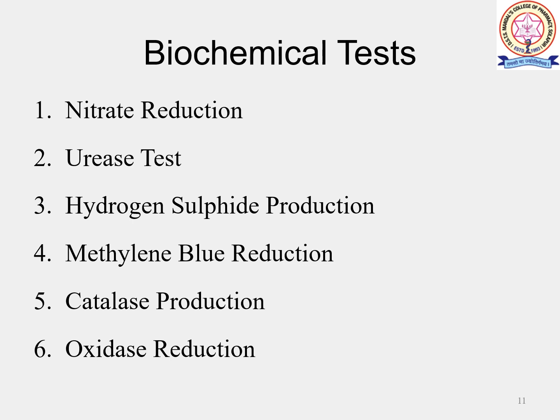The test can also be done by Kovacs method. That is, a strip of filter paper soaked in the oxidase reagent is placed in a petri dish and the colony to be tested is smeared on the paper in a line about 5 mm long. In a positive reaction, the smeared area turns dark in 10 seconds. The requirement is that the solutions should be freshly prepared.